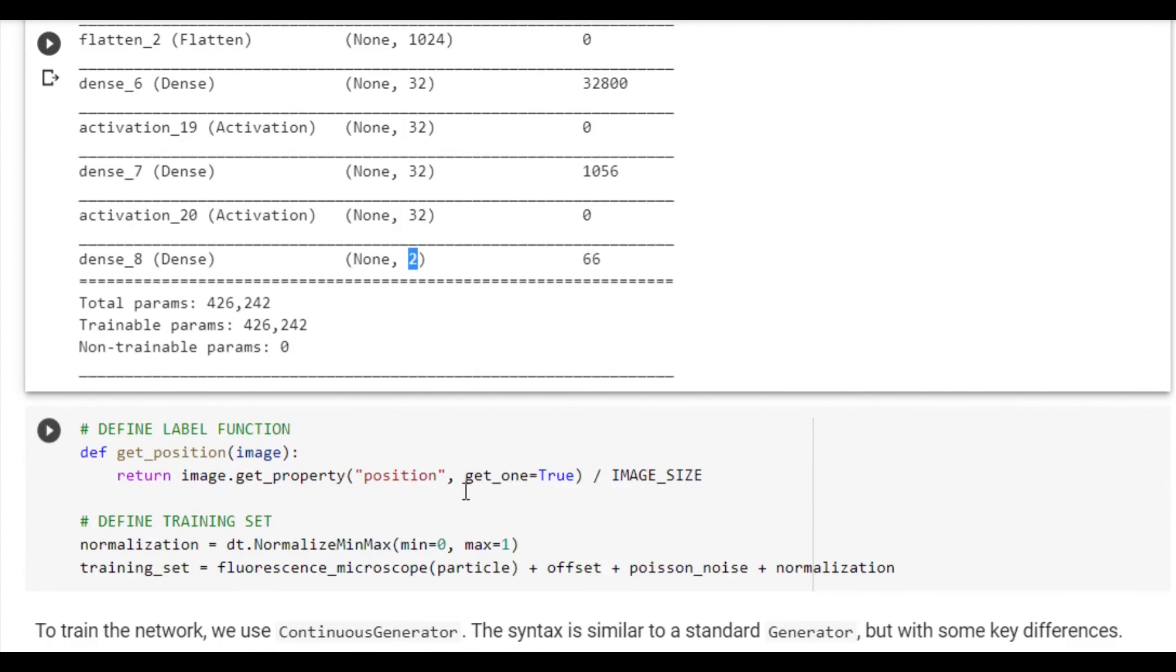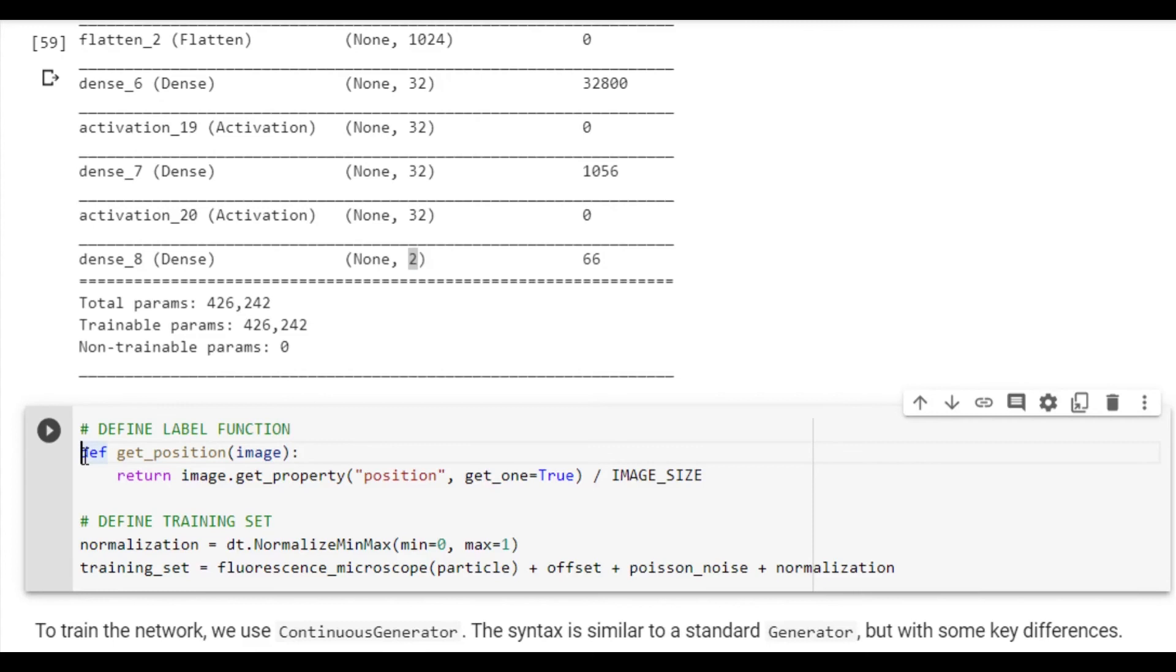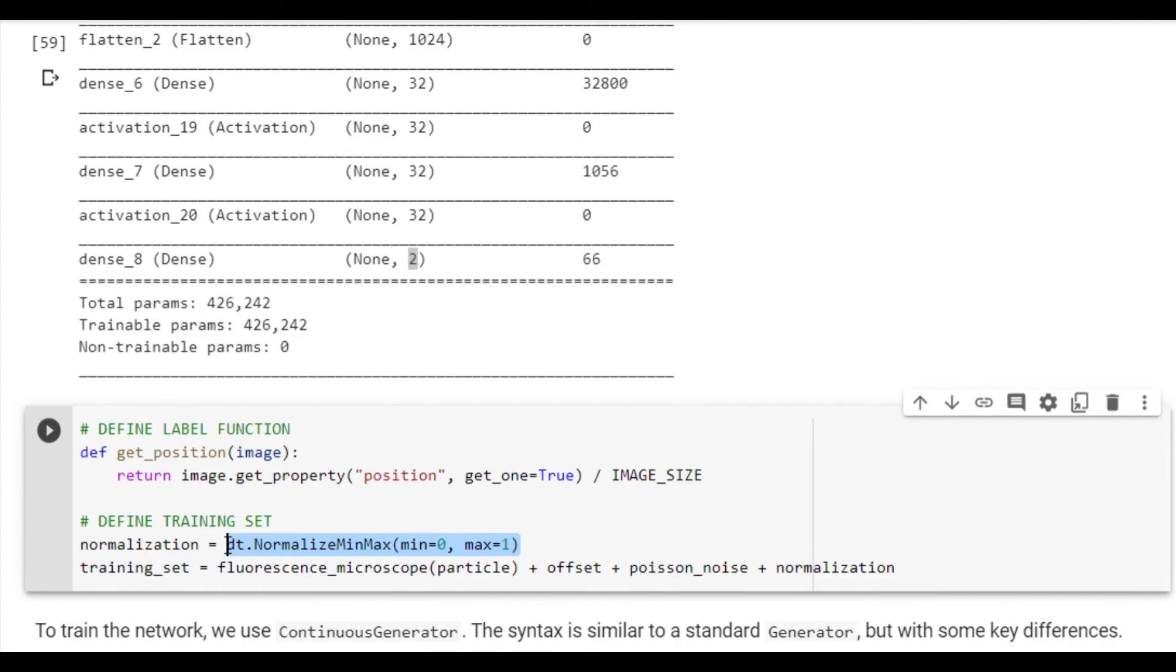Now we are ready to combine all of our knowledge into a single data generation pipeline. We define a function that returns the position of a single particle and divides that by the size of the image. We also define a normalization feature which scales the input image to be exactly between 0 and 1. We use the fluorescence microscope to image a single particle. To this, we add offset, Poisson noise, and finally the normalization, all using the plus operator.